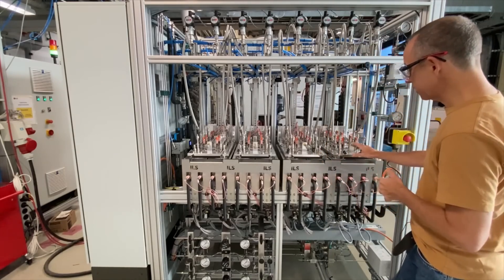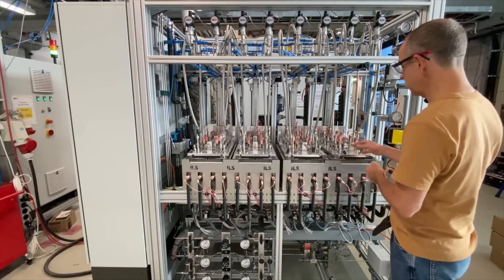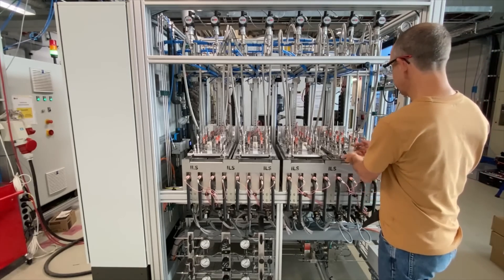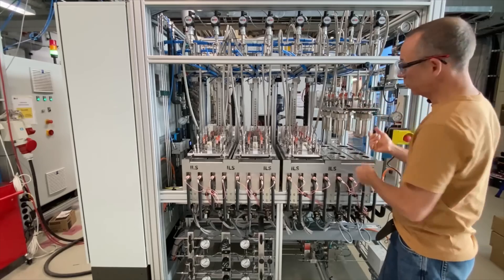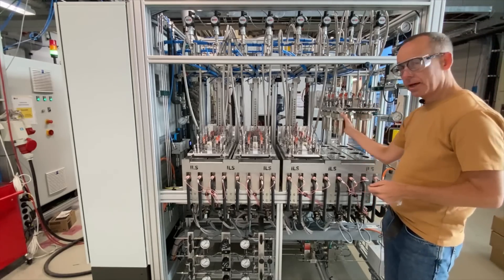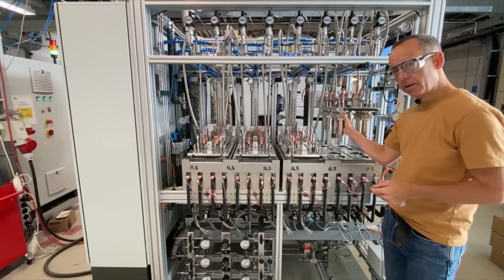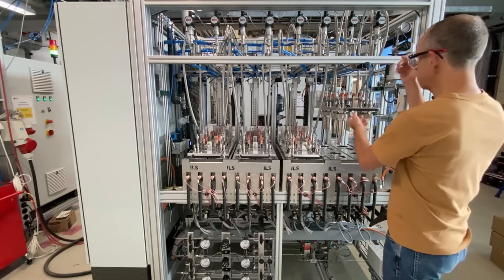One of the really nice aspects mechanically in this unit is the ability to open and close these reactors very easily. Our mechanical engineers put a lot of work into this — we have a pneumatically actuated system where you simply actuate one pin here and raise it with one hand, and by doing so I was able to raise this entire block. The actual reactors themselves are finger-tight here with an O-ring seal, and closure of the reactors is the same.